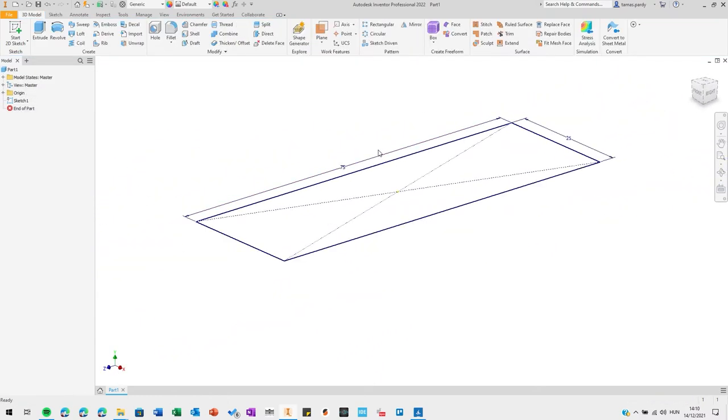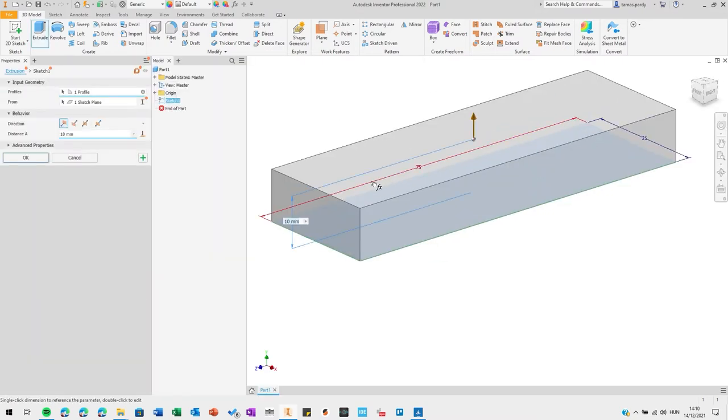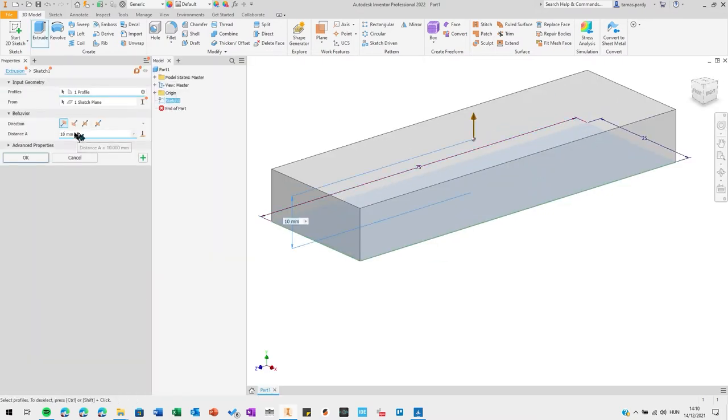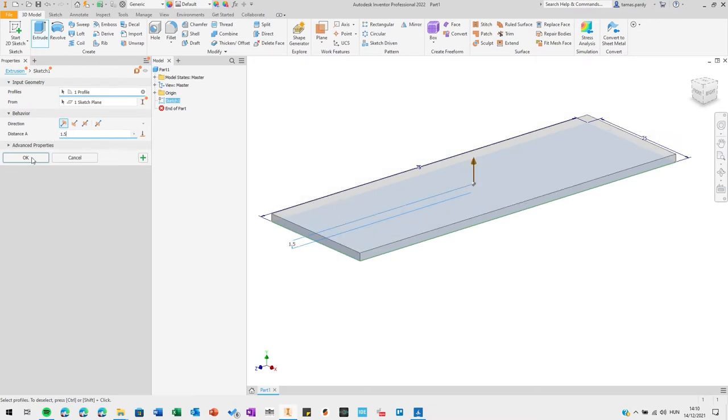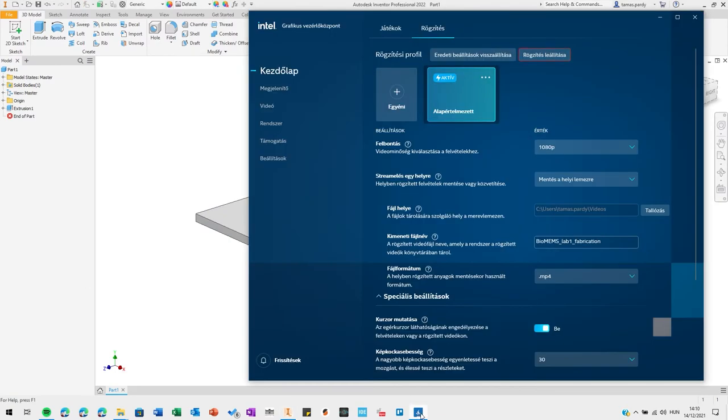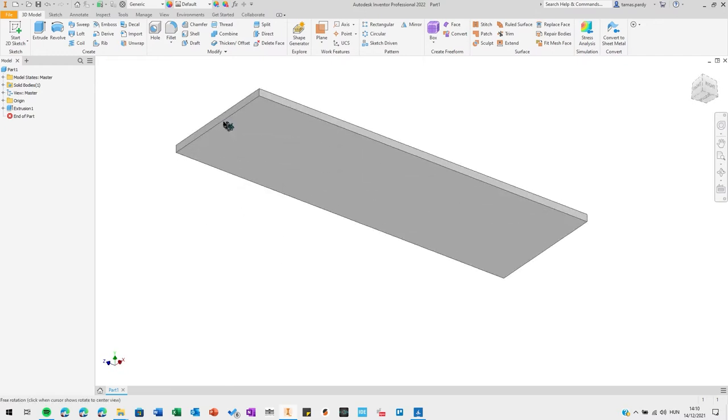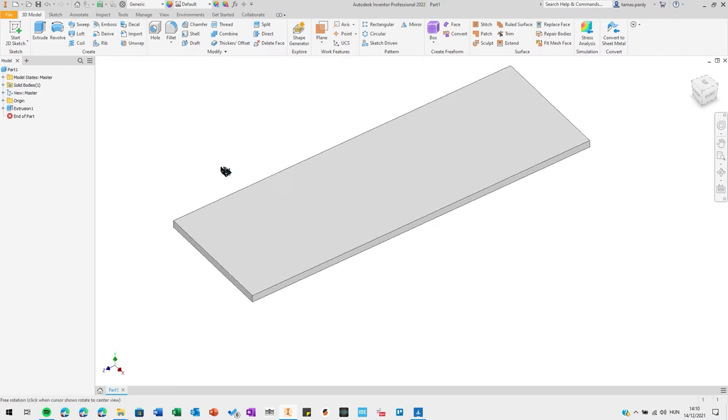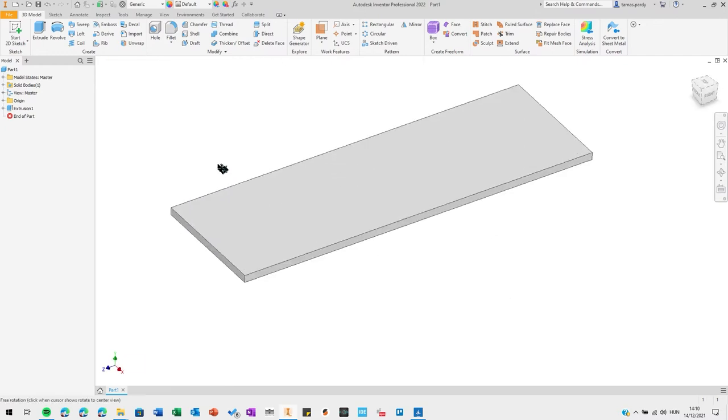Now you need to extrude. So far this has been 2D CAD. Now we make it 3D by extruding. Chip thickness is 1.5 millimeters. So you need to extrude by 1.5. Now you have a brick, which is the body of the chip.